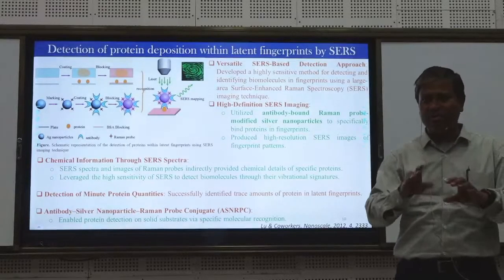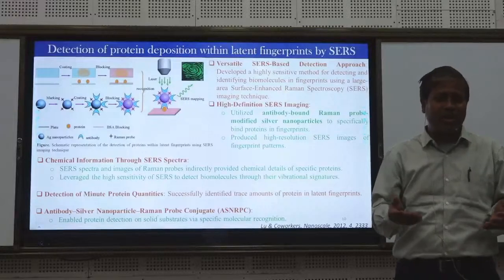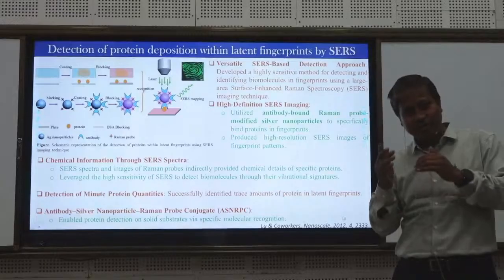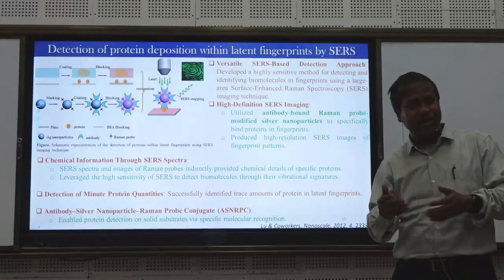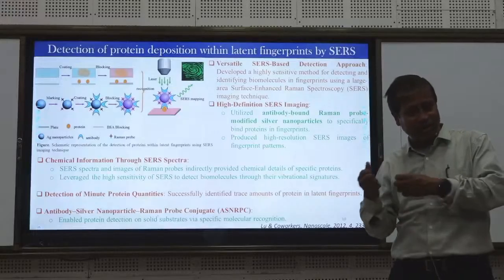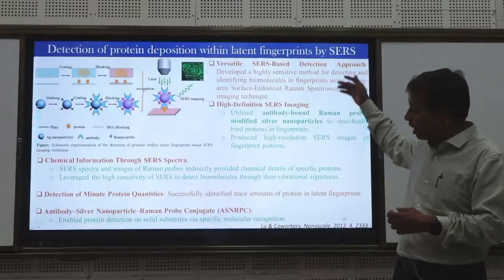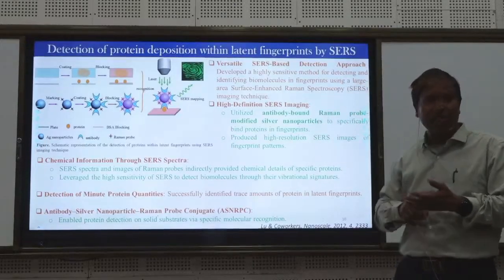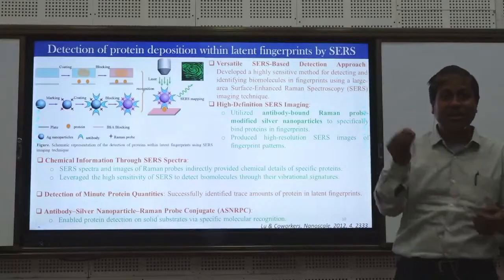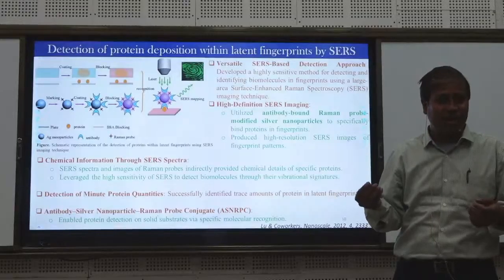In many cases you will see that the spectrum change is so small that apparently you feel like there is no change. So those groups devote themselves to finding numerical methods, statistical methods, to get data from that. Because for forensic or medicinal work, you cannot just publish, telling that this is a cancerous cell, because of 1 or 2 studies you are feeling.